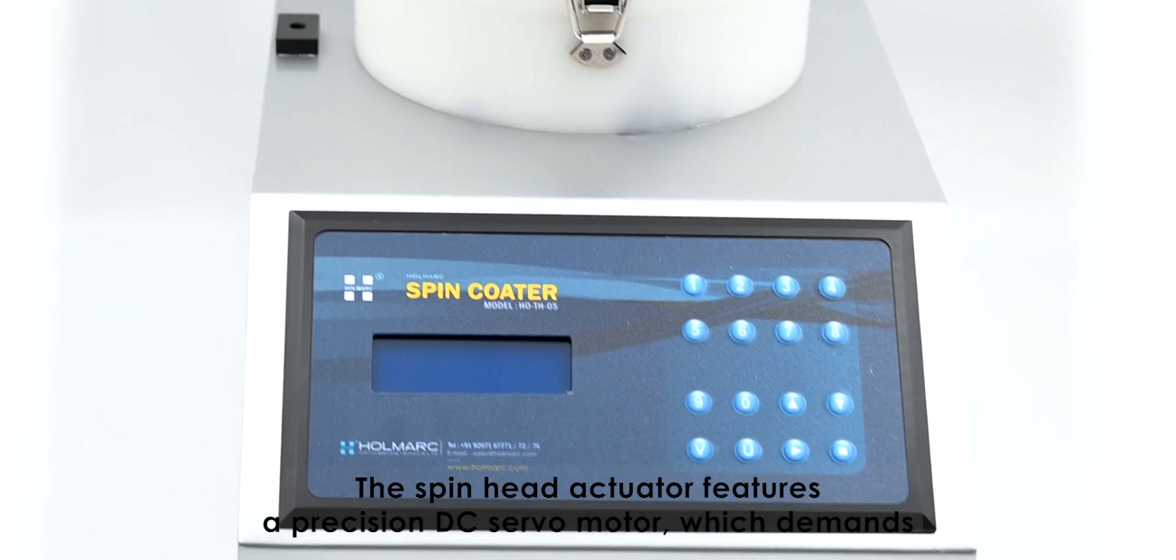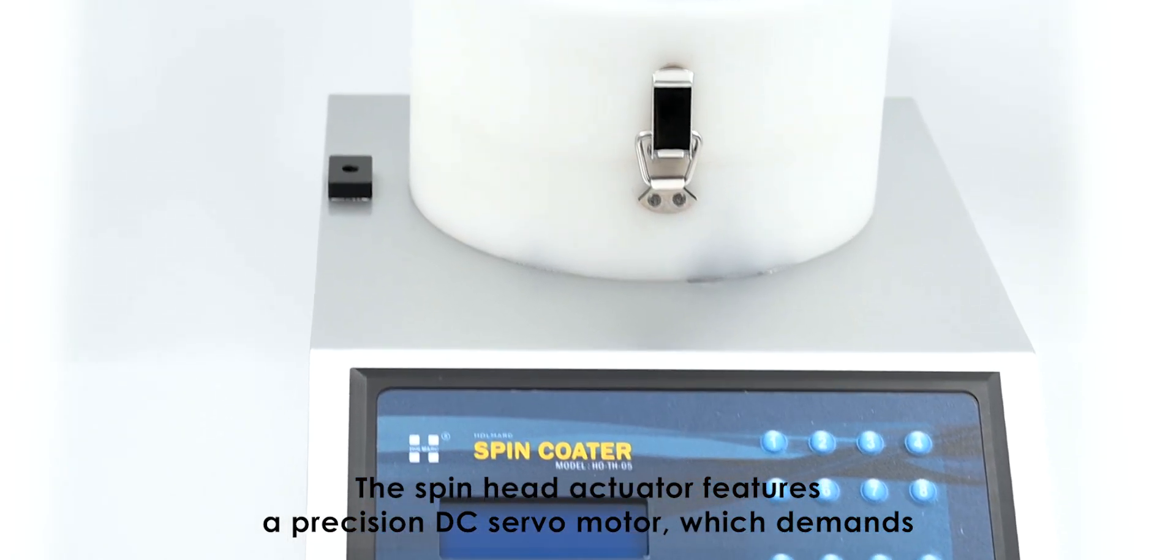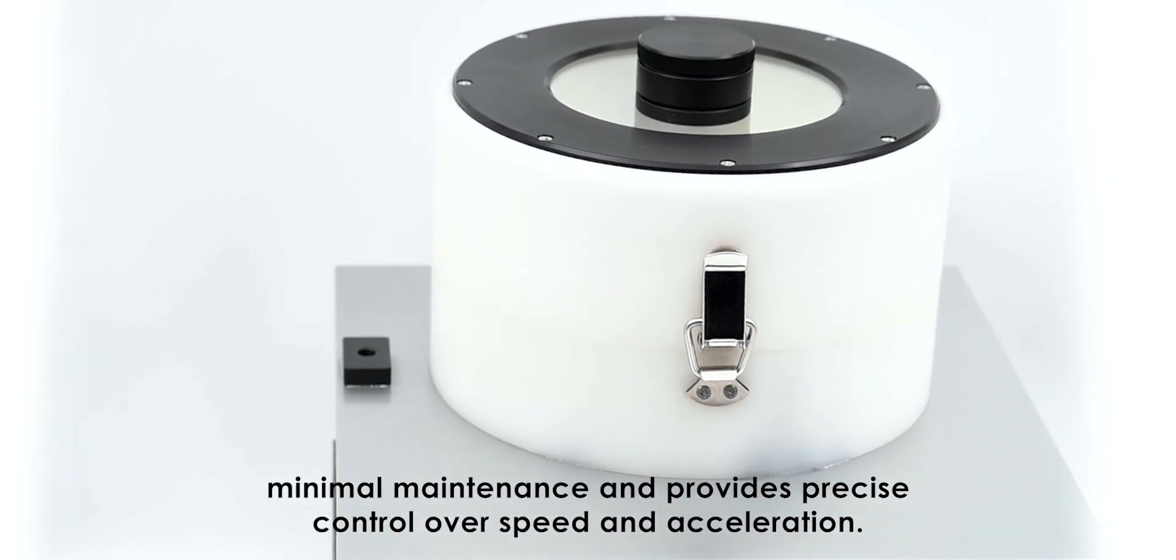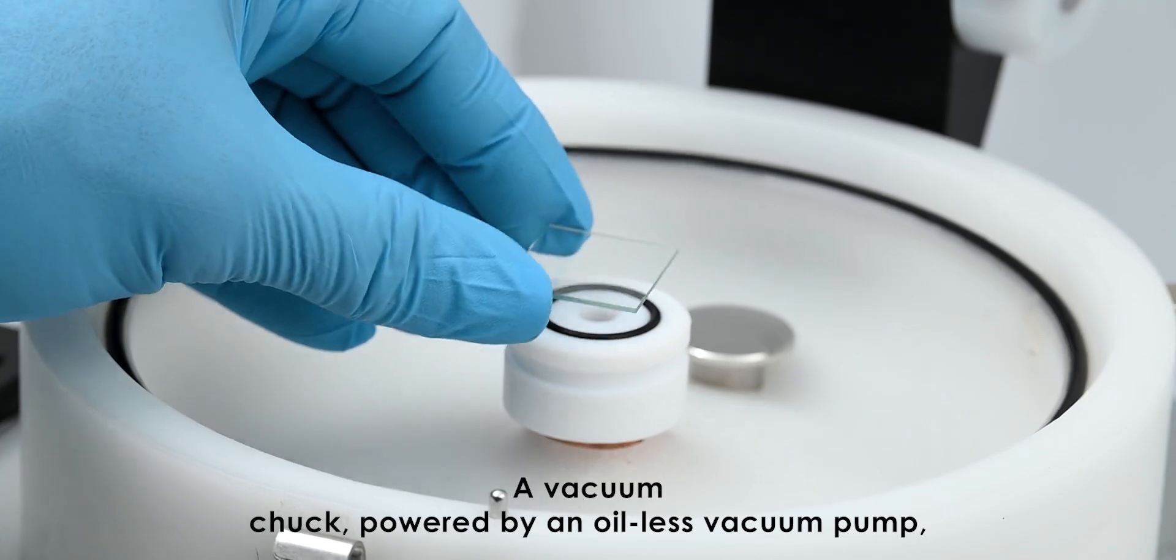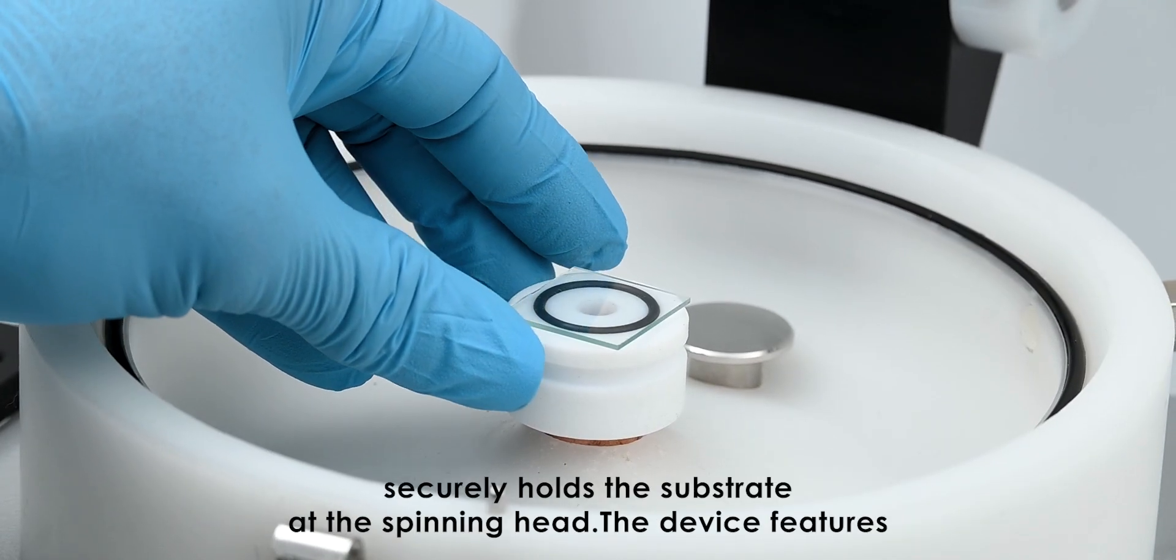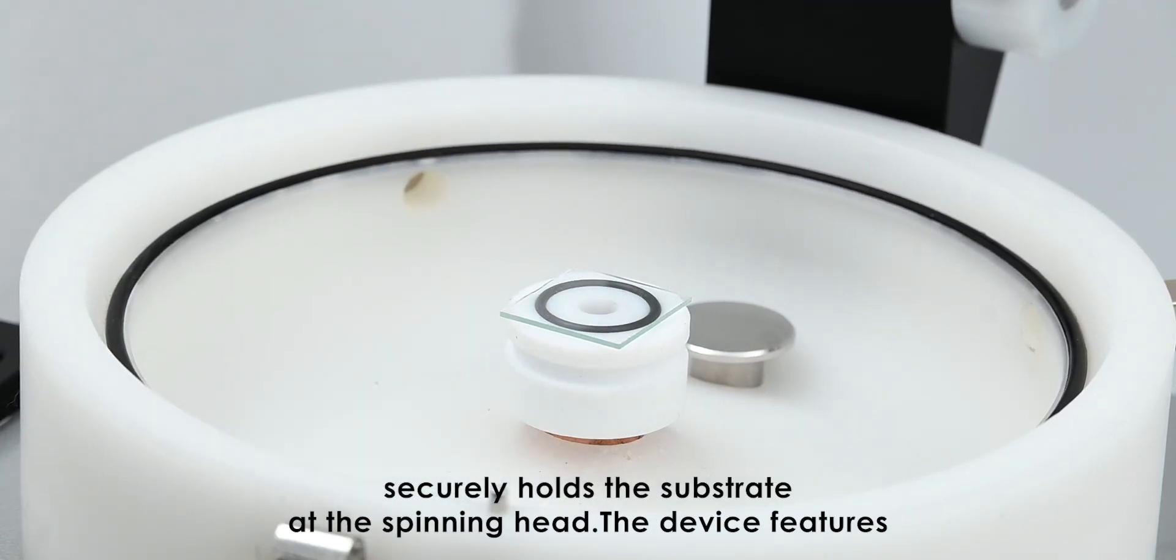The spin head actuator features a precision DC servo motor which demands minimal maintenance and provides precise control over speed and acceleration. A vacuum chuck powered by an oil-less vacuum pump securely holds the substrate at the spinning head.